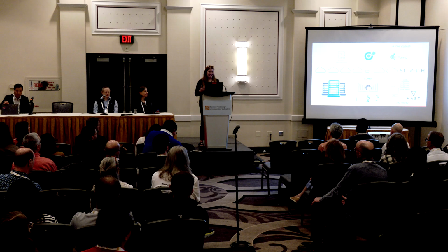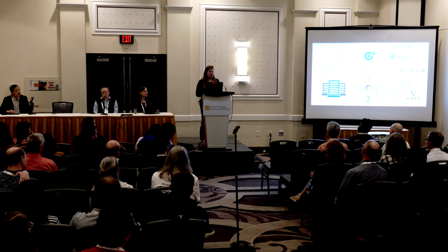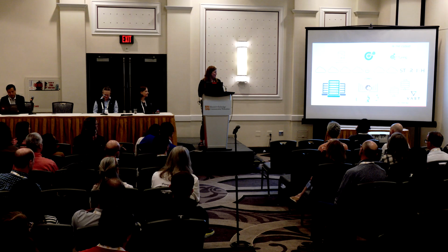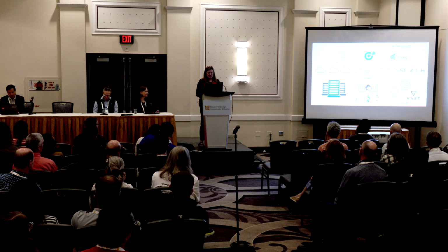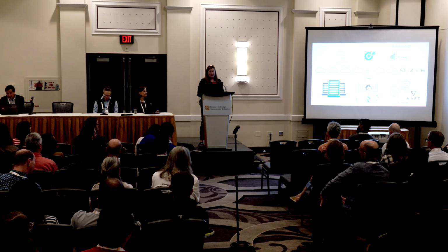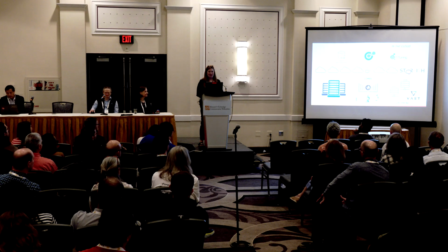I can find it in less than an hour and send it to him, using the institutional knowledge that in 2016, Gerald was in Inder Verma's lab. I look through all of those, scrape the metadata from this FastQ Screen to find blue whale, and then send him that data that he generated. But that all only exists in my brain. Part of the effort we've had in the last couple of years is that we have a Starfish license and deployment on campus, to try to move that knowledge out of just my brain and into Starfish.